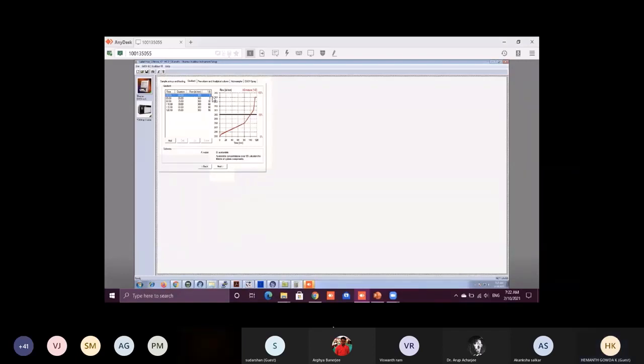When I am gradually increasing the percentage of my hydrophobic solvent, the hydrophilic peptides will be eluted first, followed by hydrophobic peptides. Okay, so this is the logic. We are generally increasing the hydrophobicity, and those which are more hydrophobic will be eluted at the later stage. So here we are using a 120 minute gradient, meaning a 2 hour gradient, where my solvent B, the hydrophobic polar solvent, is increased from 5% to 90%. So whatever peptides are coming will all be eluted.